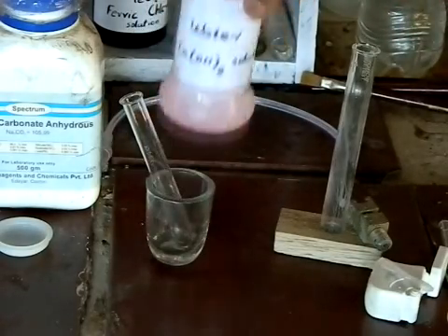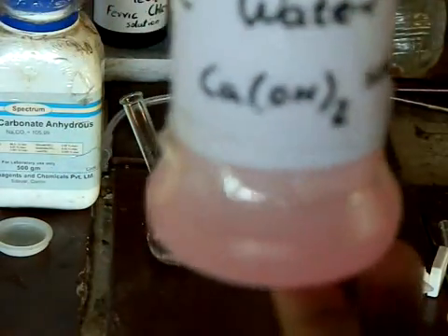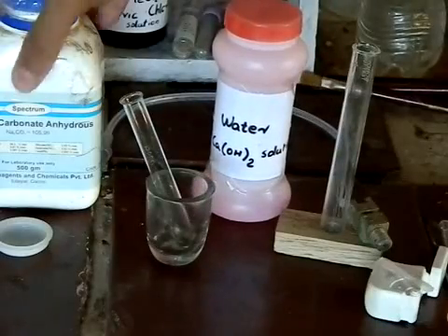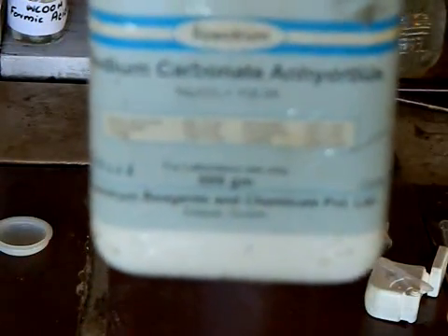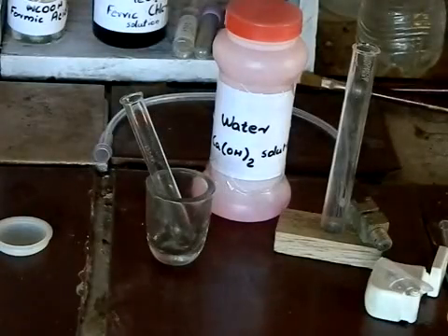For this experiment, we will need some lime water — that's calcium hydroxide solution — and some sodium carbonate. I am using the anhydrous one, but you can use the hydrated form as well.